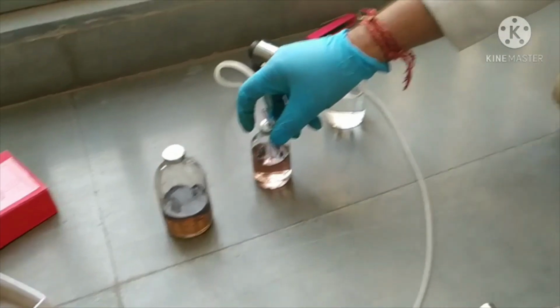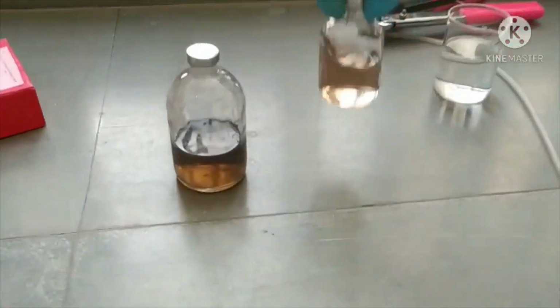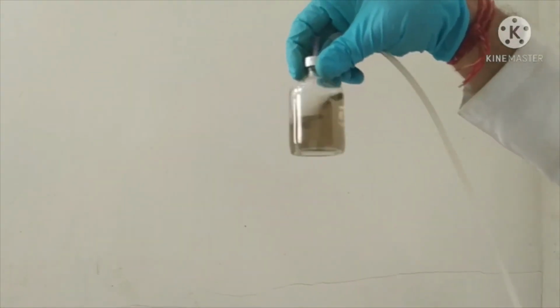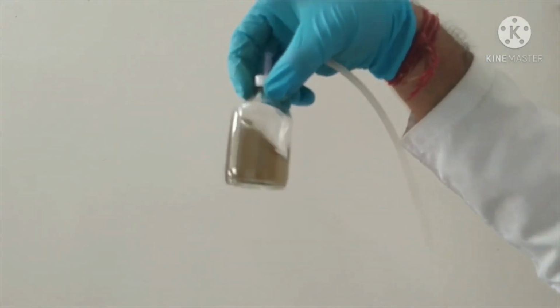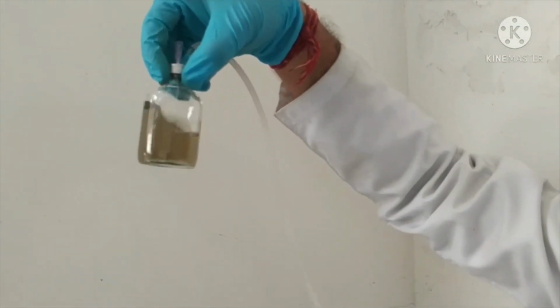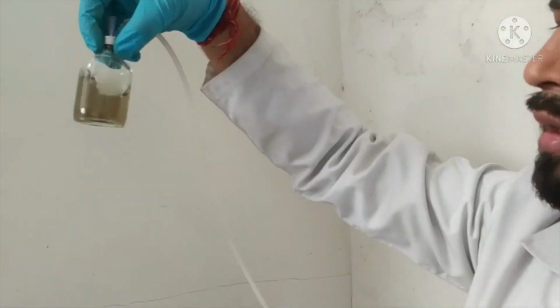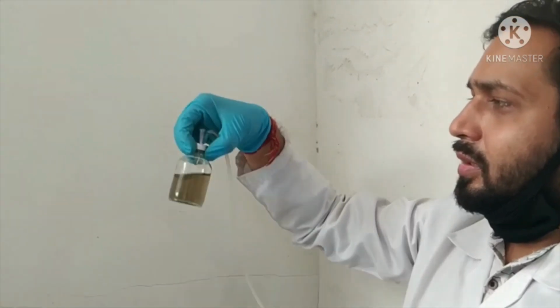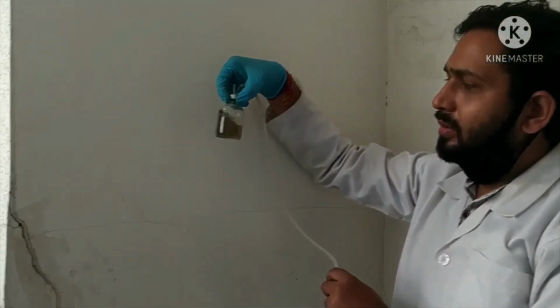When we provide the anaerobic condition here, you can see the color has now changed. When we have provided the CO2, it is showing colorless, totally transparent. A little of the media color is coming, but the resazurin color goes down to colorless. So it means that the condition is now fully anaerobic. Now we can inoculate the culture after autoclaving and the rest of the process.